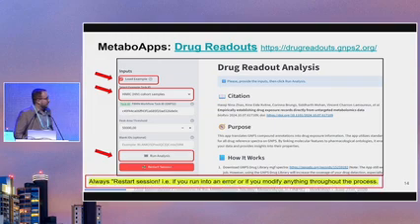I always like to remind, not only for the hands-on session, but whenever you're working with your own data set, to always click on the restart session button whenever you choose anything in your analysis. Not only on the initial step, but if you type something really different, or if you choose some parameter that is really different on the next steps, always restart the session just to make sure that you have the most updated parameter on the data that you're looking at.